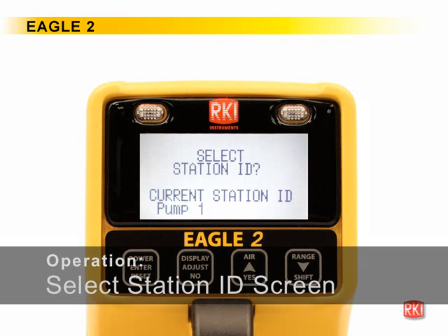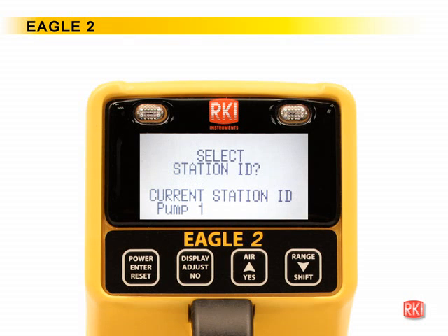This screen displays only if User Station ID in the Setup Mode menu is set to On. Use this screen to select a station ID from the Station ID list in the Eagle 2's memory. The current station ID is displayed. A station ID can be up to 16 characters long, and the Eagle 2 can store up to 128 station IDs. The corresponding station ID number identifies the current station ID's place in the Eagle 2's list.